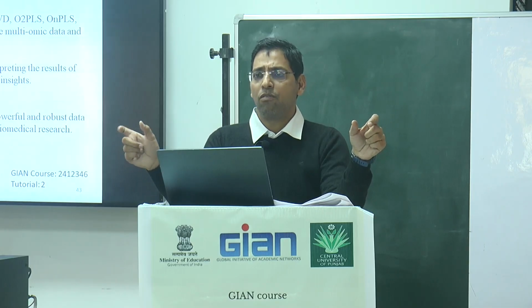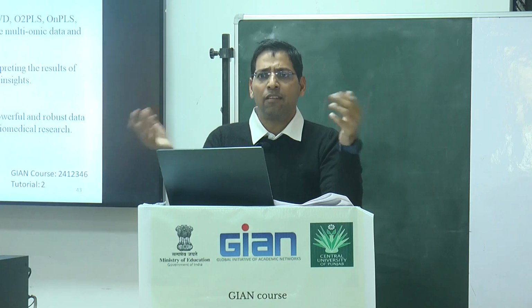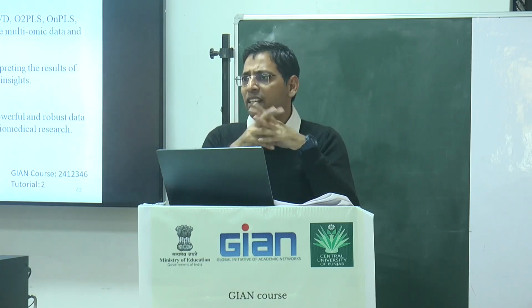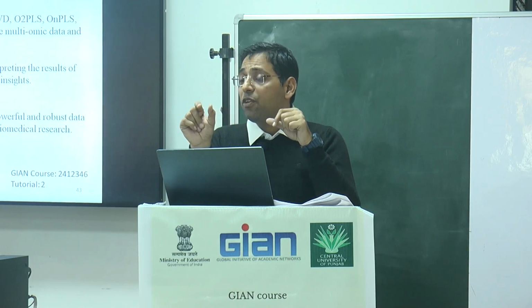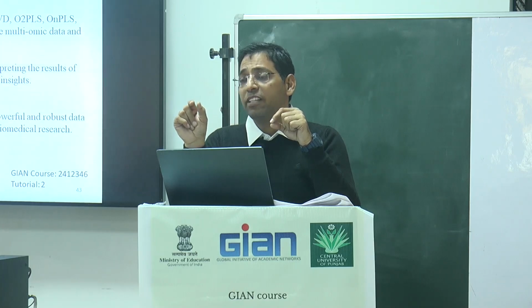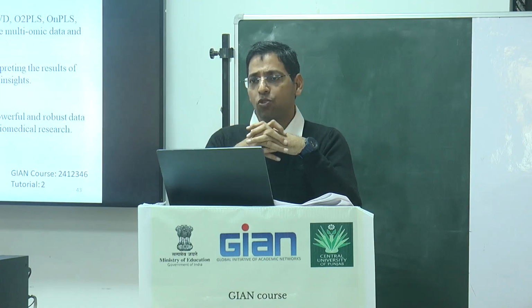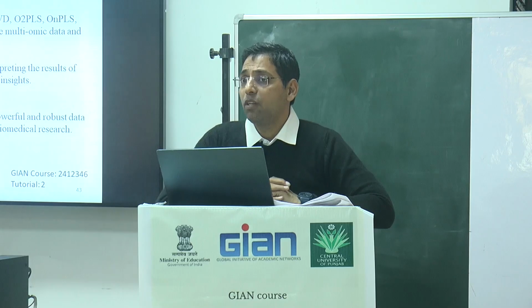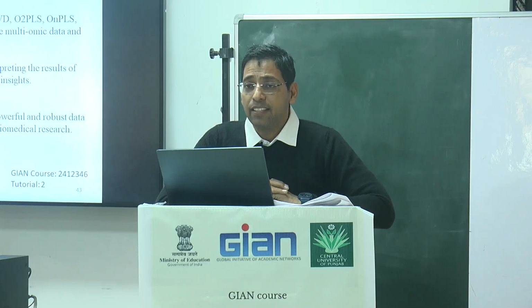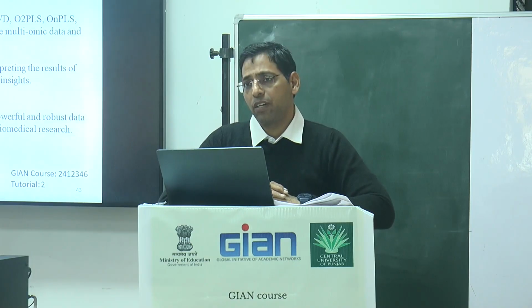But because of manual work, there are some technical errors, machine has some issues, handling errors, you know. So sometimes this retention can shift from one place to another. If we change a little bit, this retention can give you a different value also. So we can't say, but yes, every metabolite in a particular predefined condition has a constant retention time.